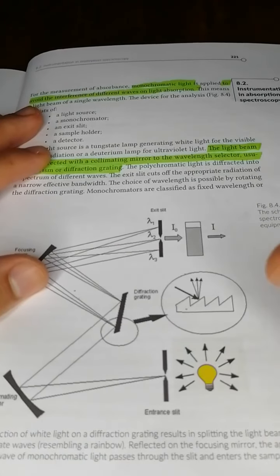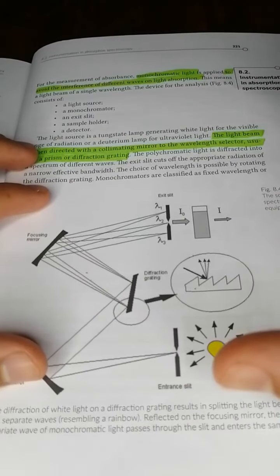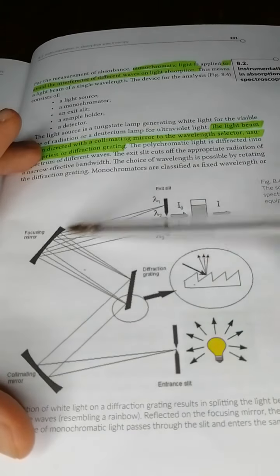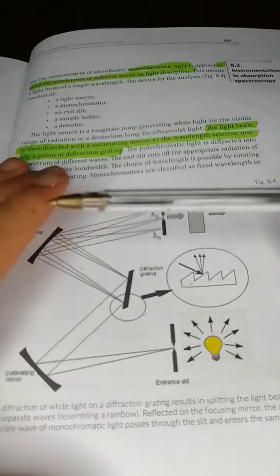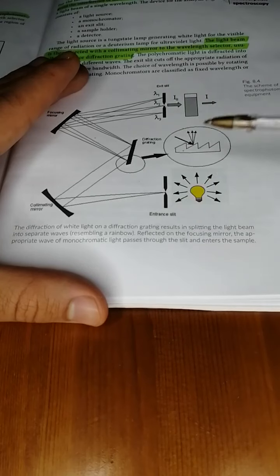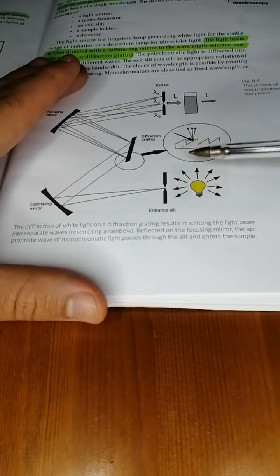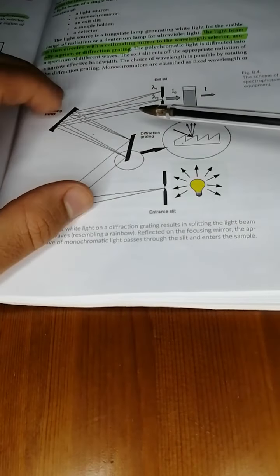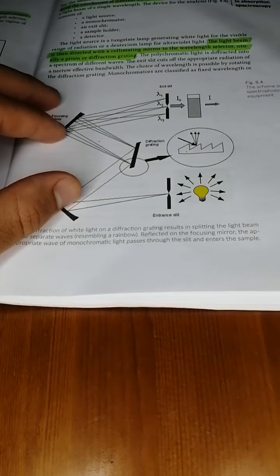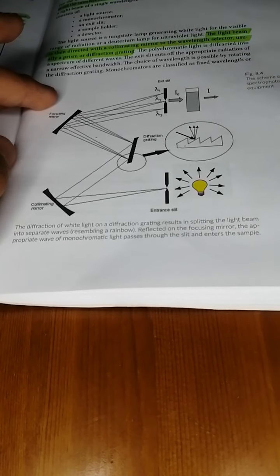So how do we set up absorption spectroscopy? First of all, I like to use this diagram because it explains everything very well. You have visible light, the light that we see. If you remember from high school, you will remember the prism experiment: when light goes through a prism, it gets diffracted, meaning it gets separated into its components.